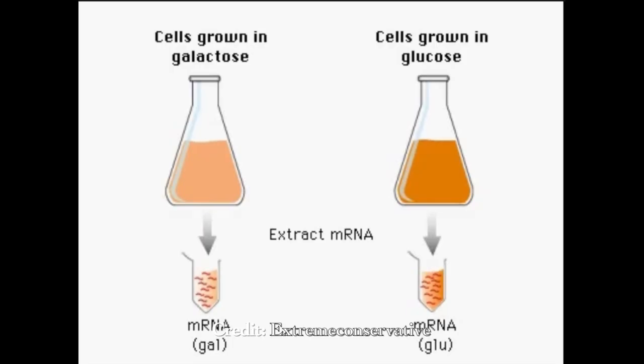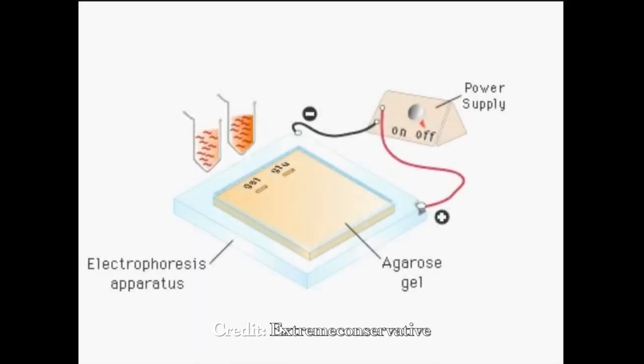If we start with northern blot, the first step is to isolate the RNA from your samples. After the RNA isolation, for northern blot, you will load the RNA onto an agarose gel and perform gel electrophoresis. This, of course, will allow you to separate the RNA based on size.